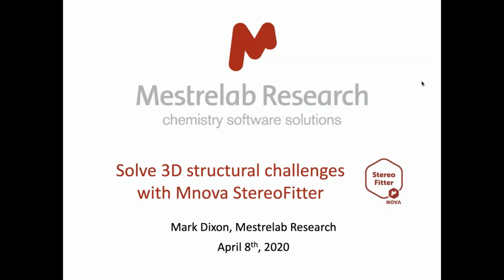I'm sure we've all scrawled 2D structures on a fume hood window with a magic marker using wedges and dashes to indicate chirality. But when it comes to imagining how the whole molecule relates to itself structurally, I will wager that not many of us had the patience to sit down with their plastic modeling kit to build one. And even if we did, there are ambiguities about which way this bond goes and which conformation that ring adopts, leading inevitably to us staring at a single example from a larger set of possibilities, with no real confidence that we've built the one that actually exists in solution. Any decisions that we make when looking at those 2D drawings or that 3D stick model are therefore flawed by a lack of complete information.